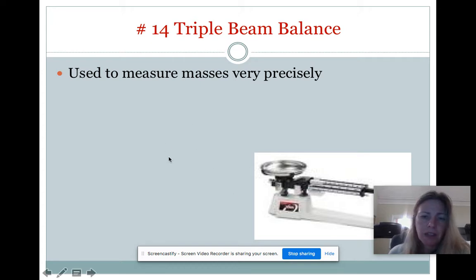And they actually will have like a glass cover so that even if the wind or dirt is going in from the air, it would actually measure that. So it could be completely enclosed, the electronic balance. And we'll be dealing with electronic balances. You'll see those in class.